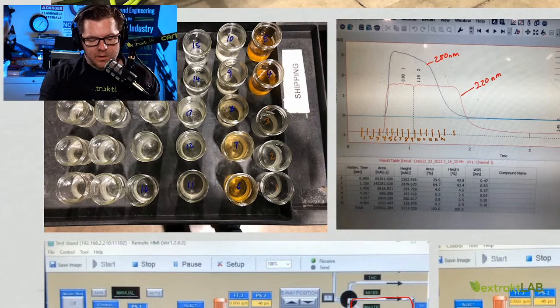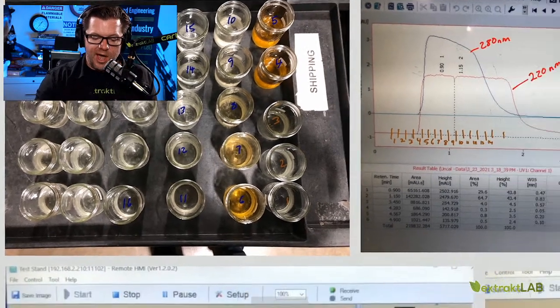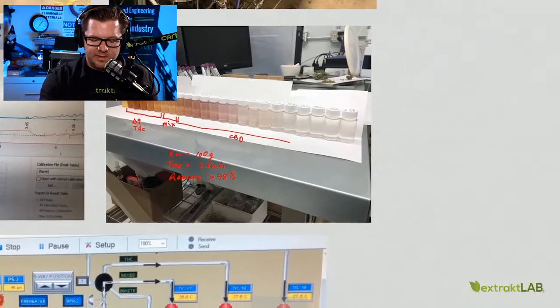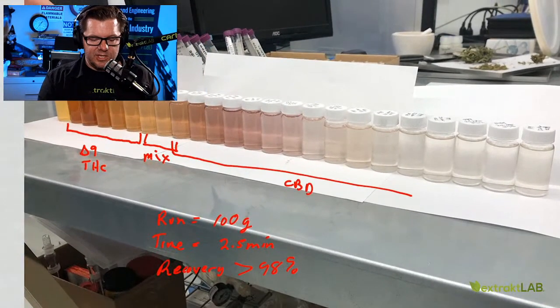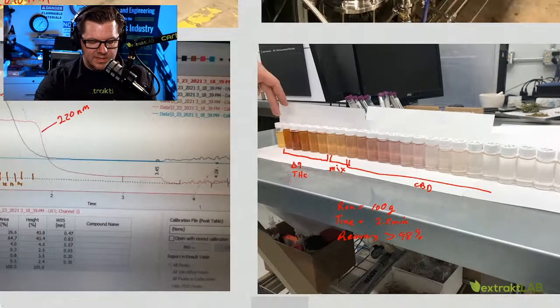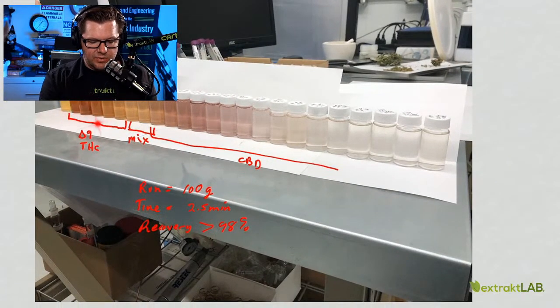Now, once we have all of these vessels here, typically we need to work them up and test them. And we typically have an HPLC in order to do that, because you want to know how much of the THC and CBD is in each of those. So we do a sample preparation. This is kind of what that looks like. So we take each of those samples, we prepare it, and we put it into a vessel here. And you can see this is a picture right here of those different vessels. And you can see the Delta 9 we showed right here comes out very nicely in this. There's a little mixture here, and then this is all CBD.